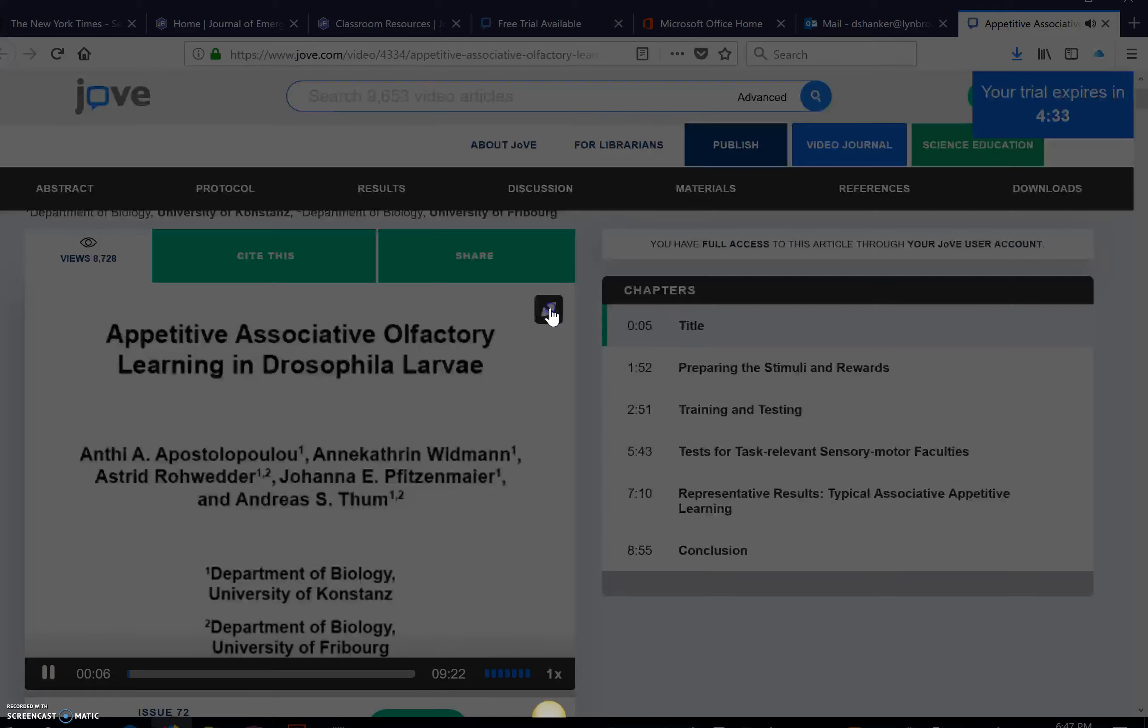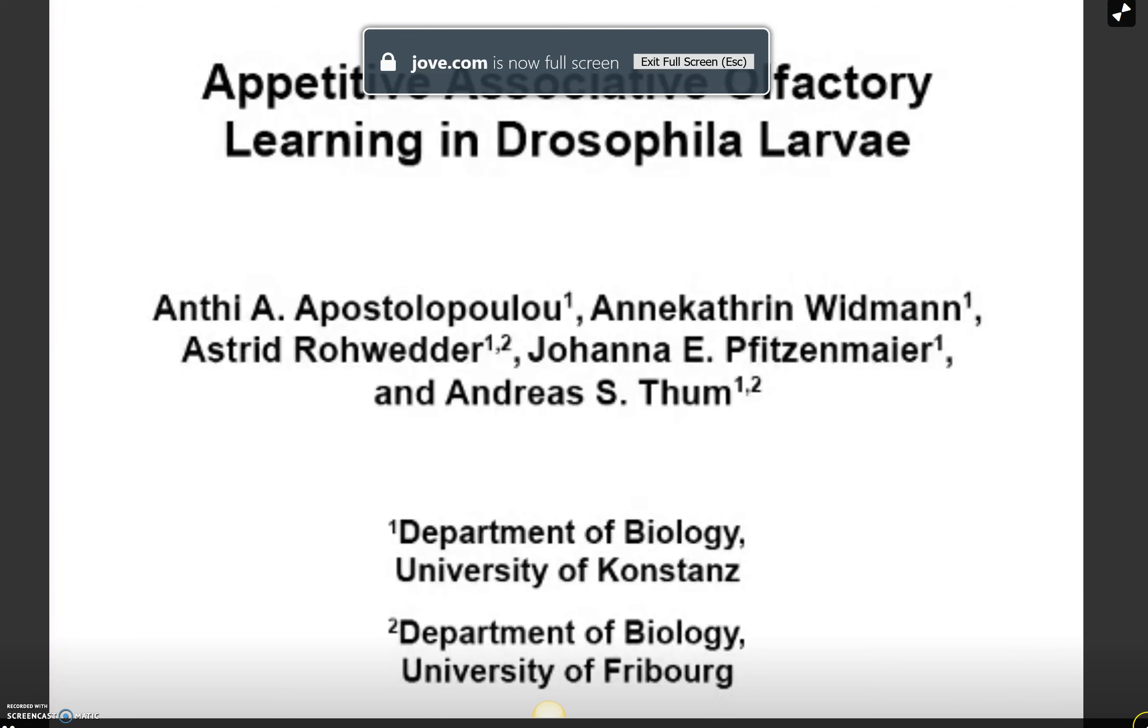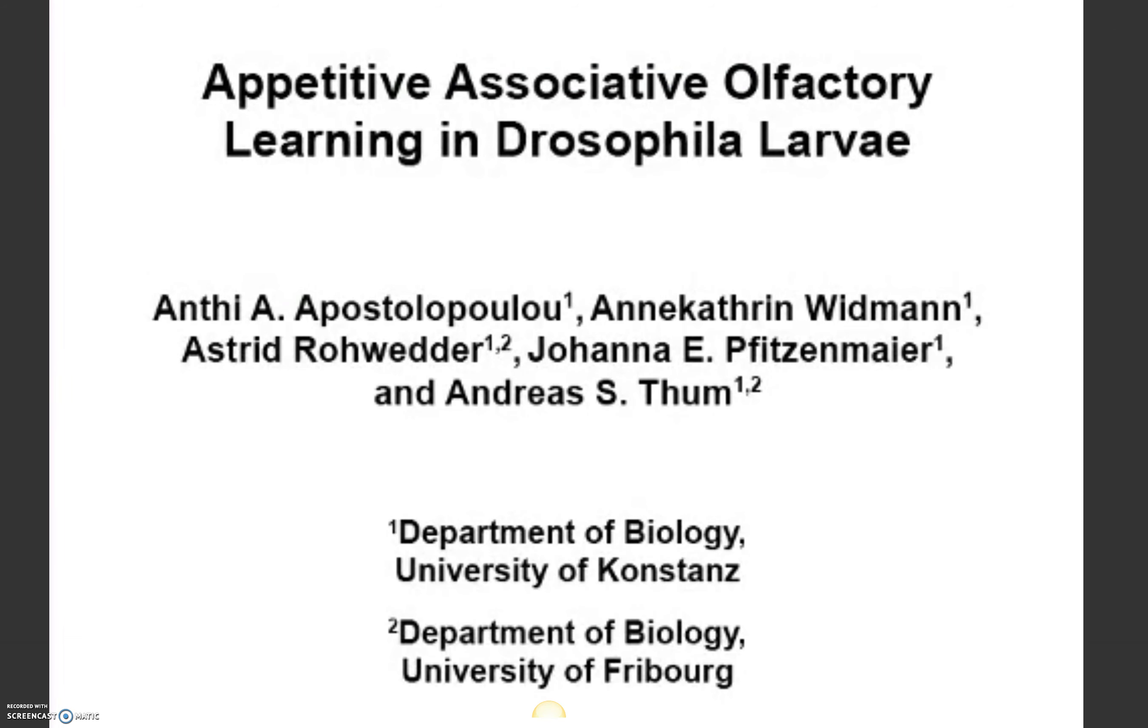The aim of this procedure is to analyze higher brain functions in a simple model, Drosophila larvae, by means of appetitive, associative, olfactory learning.